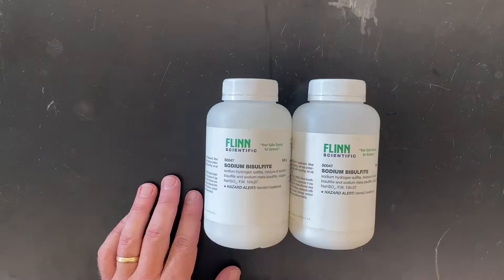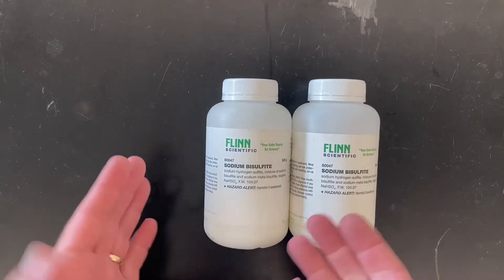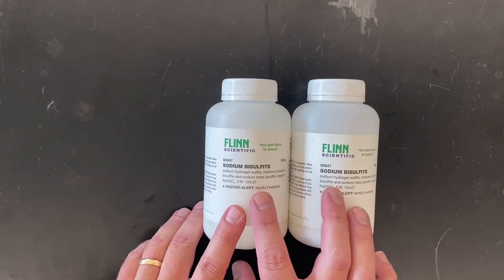Next we have a couple of bottles of sodium bisulfite. This is also a weak acid. A lot of people don't know that right off the bat and it's kind of hidden because the word 'acid' is not in the name. But the bisulfite ion is actually slightly acidic in solution.